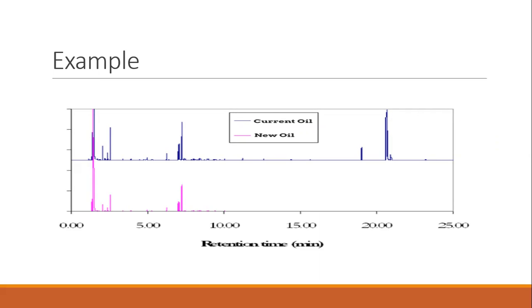This basically is vegetable oil analysis. As you can see in this case, a food manufacturer was considering switching to a new vegetable cooking oil. After a vegetable oil analysis of both their current and a potentially new oil, we found that their current oil contains several different compounds, including palmitic acid, retention time of 19.00 minutes.